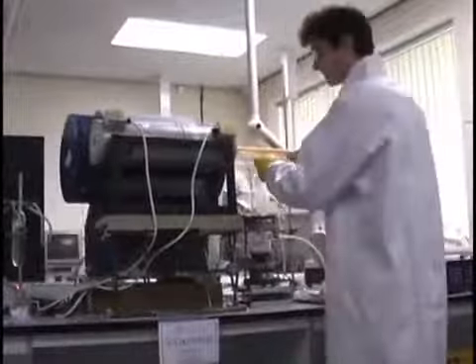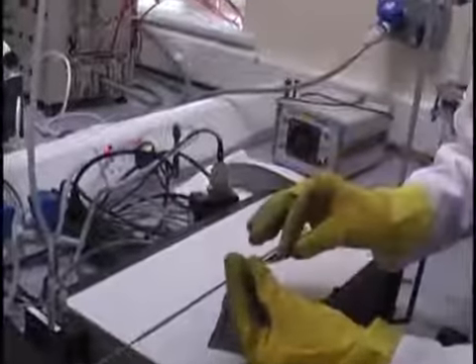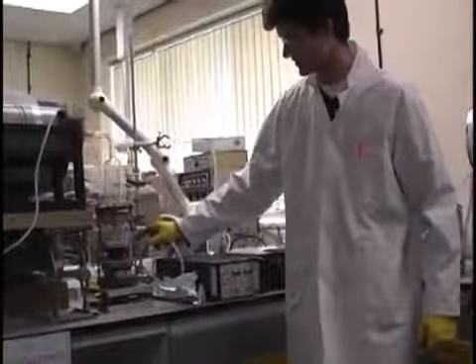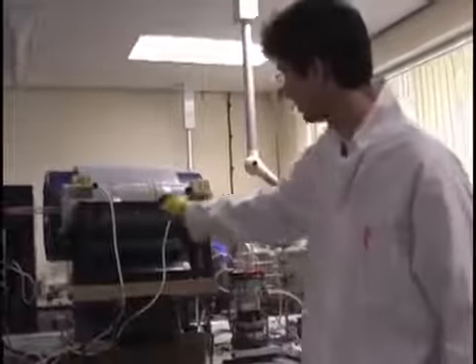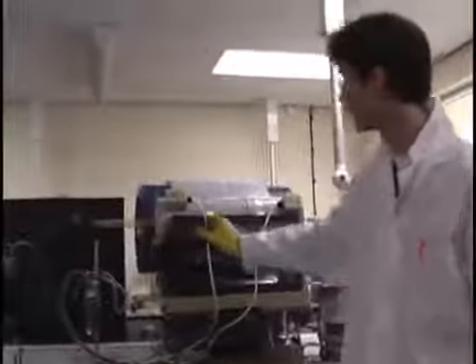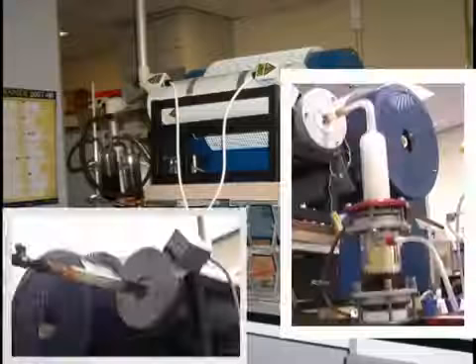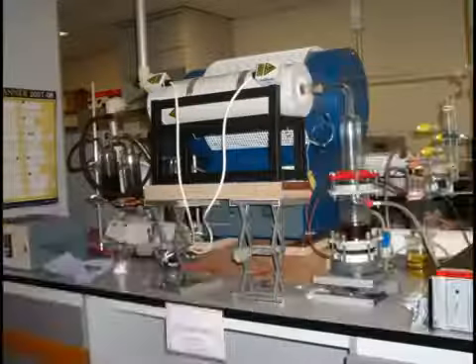The young scientist takes a clean tube and sets up the experiment. He introduces a clean base in the tube and closes all empty space with heat-resistant cotton to keep the heating. A non-reactive gas is passed through the heated solution of the hydrocarbon. The mixture passes through the furnace where the temperature can be from 300 up to 1150 degrees C. He can run the experiment for as little as 5 minutes up to hours in order to get longer tubes.